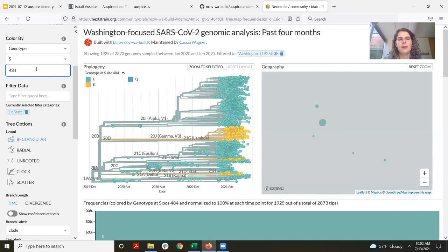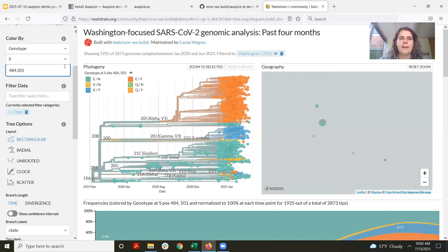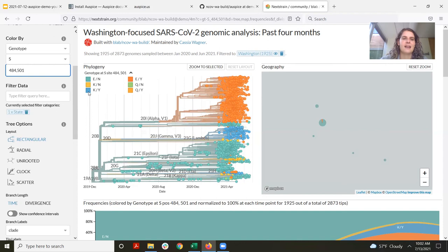You can also combine which amino acids you color by. So I can also color by position 501, for example. Now the coloring is updated by both of these options, so you can see what has a lysine and a tyrosine right at those positions.